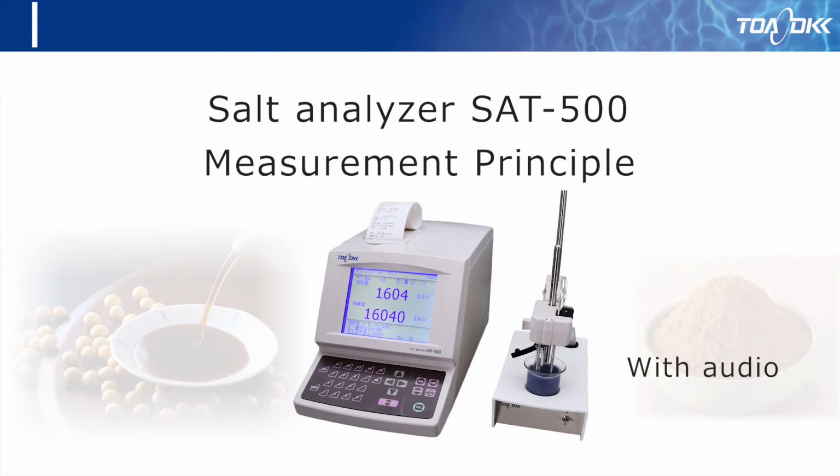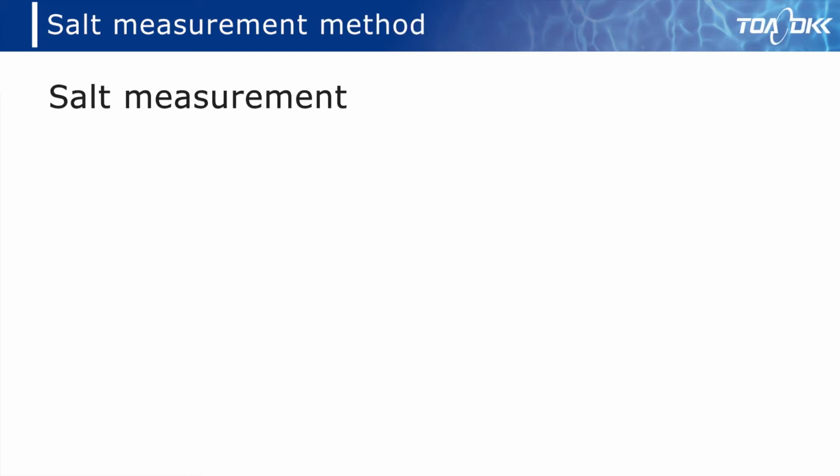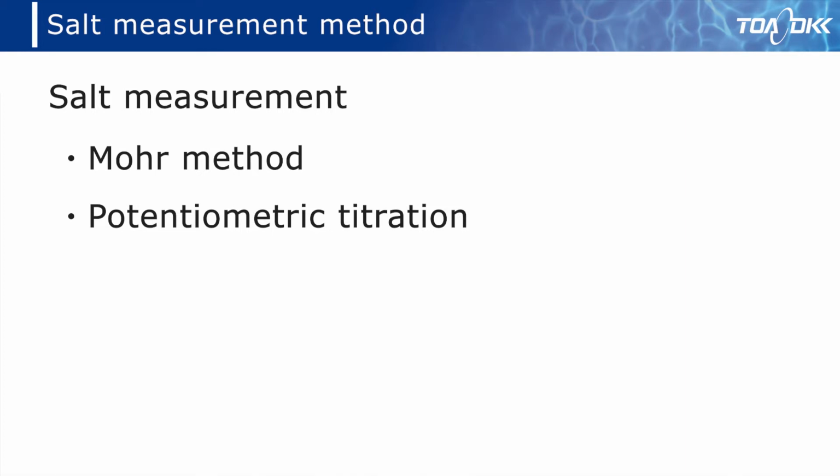Measurement principle for the salt analyzer SAT-500 is introduced in this video. Here are the contents. Generally, salt measurement can be selected from two types, Mohr method and Potentiometric titration method.